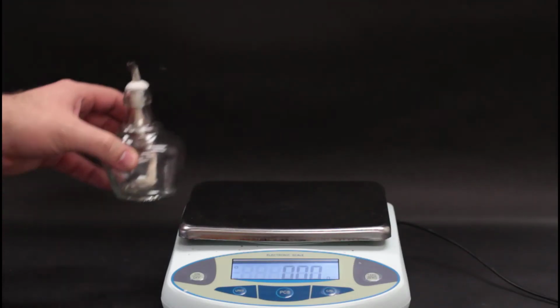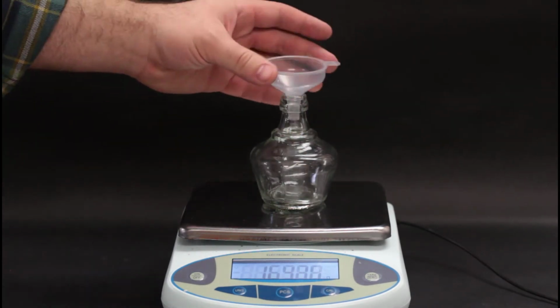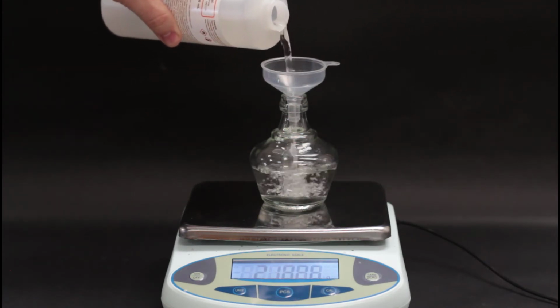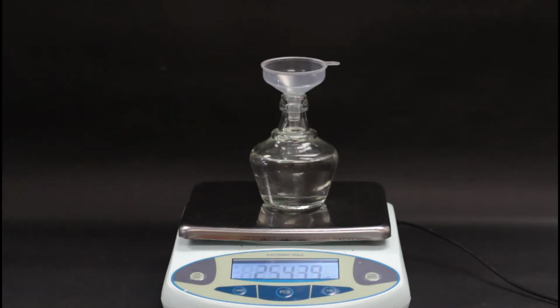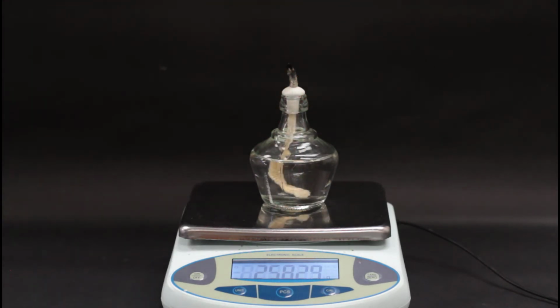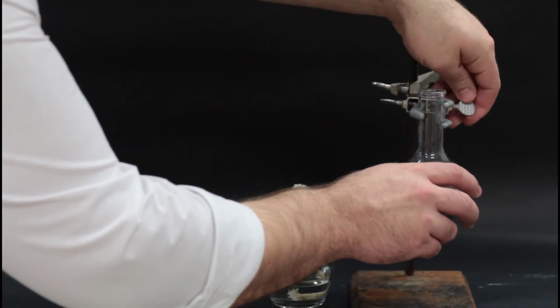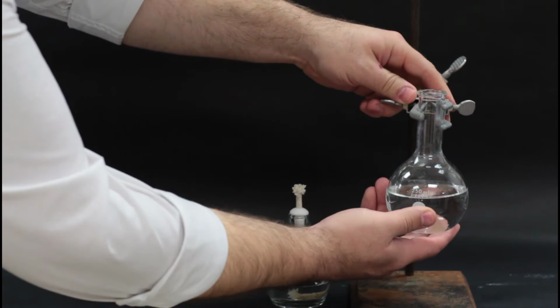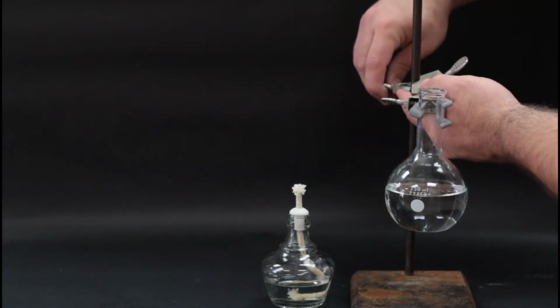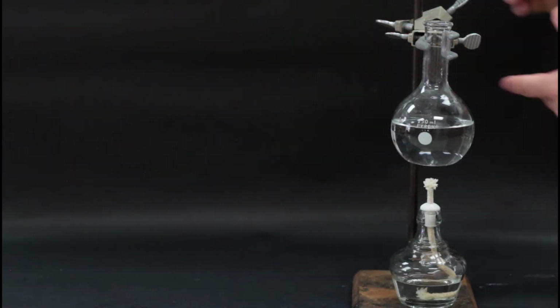For the procedure, first, weigh the alcohol burner and record the mass. Then, add the alcohol and record the total mass of the burner with the alcohol in it. You should fill the burner most of the way and make sure to include the wick in your mass. Set up the ring stand with the Florence flask clamped above the alcohol burner. The flask should be about 3/4 of an inch above the wick.